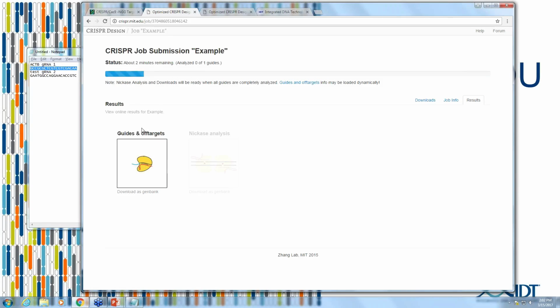Again, regarding the MIT tool, does the MIT score for the guide RNA only mean fewer off-target effects, or is there any prediction in there about the efficiency that somebody might expect from that guide RNA? Yeah, that's correct. This tool does only show you off-target rankings. It doesn't provide any kind of on-target analysis. On-target is in particular the one that I think is sensitive to how that on-target ranking was built, and so I think that's where more variability comes into play.